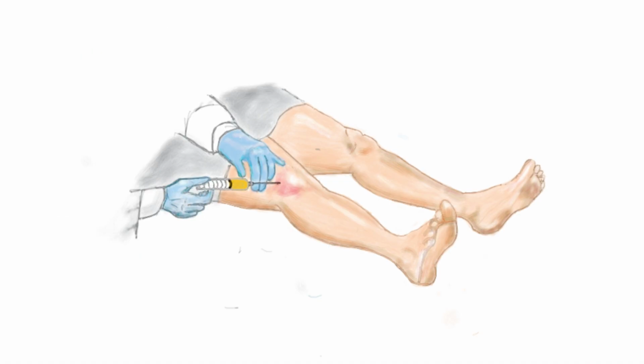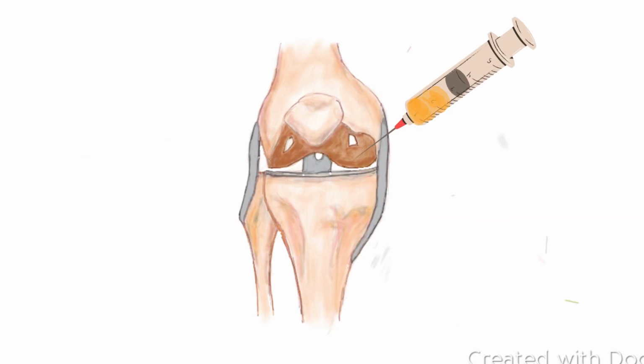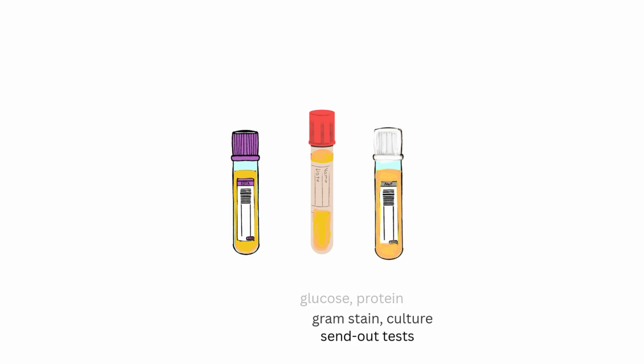In the clinical laboratory, usually the hematology department, we may be requested to perform synovial fluid crystal examinations of synovial fluid collected by the healthcare providers. Typically, cell count, differential, crystals, gram stain, and culture will be ordered.